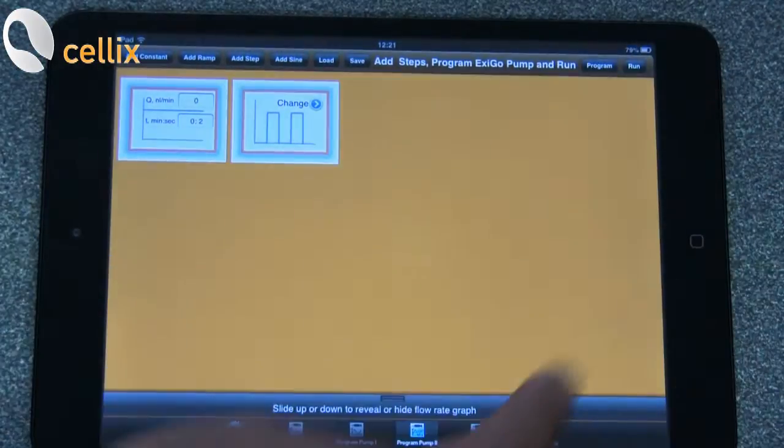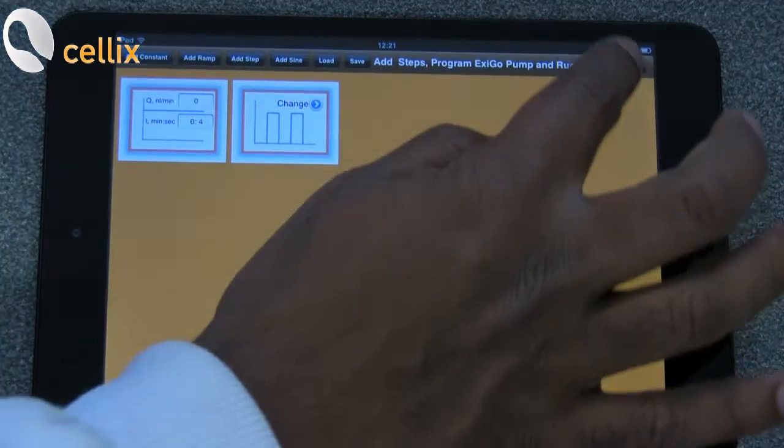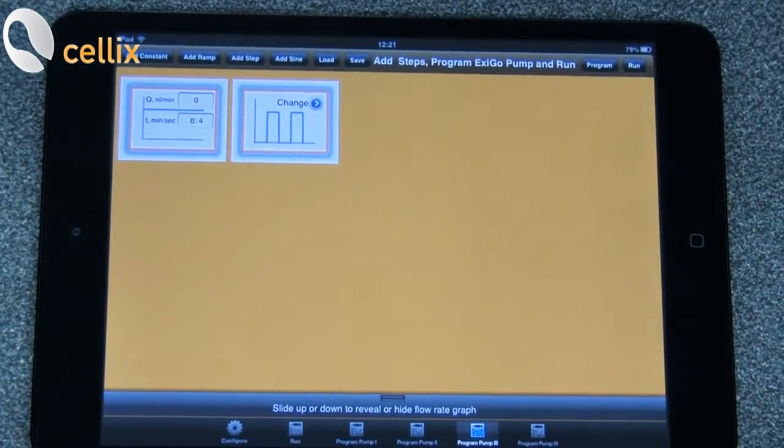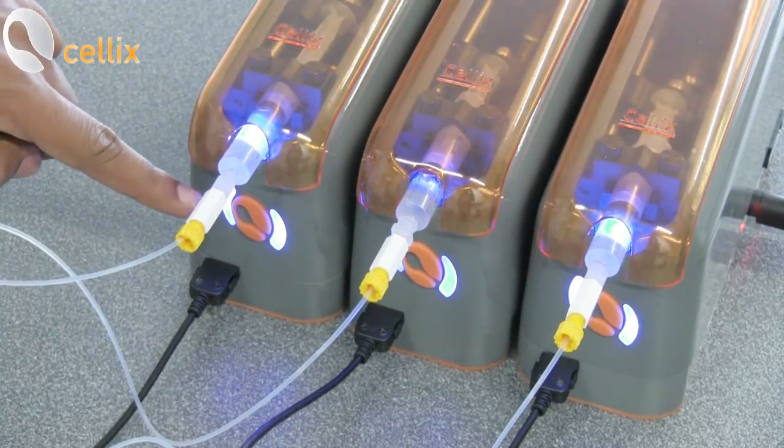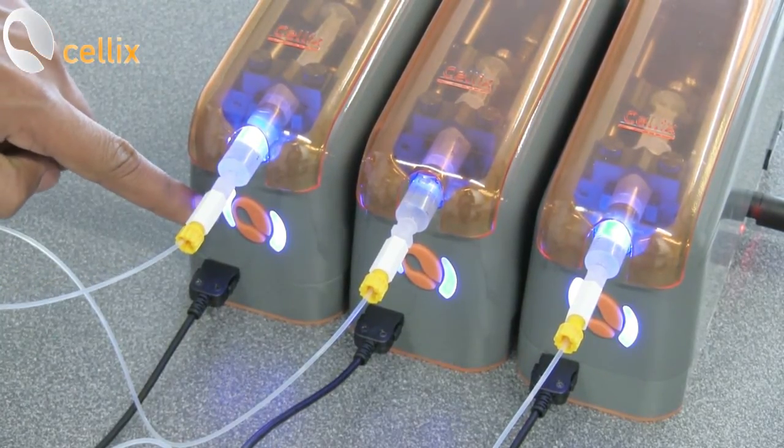The same with pump 2, same with pump 3. Once you have programmed the pump, you can see the color of the light changes from green to blue.